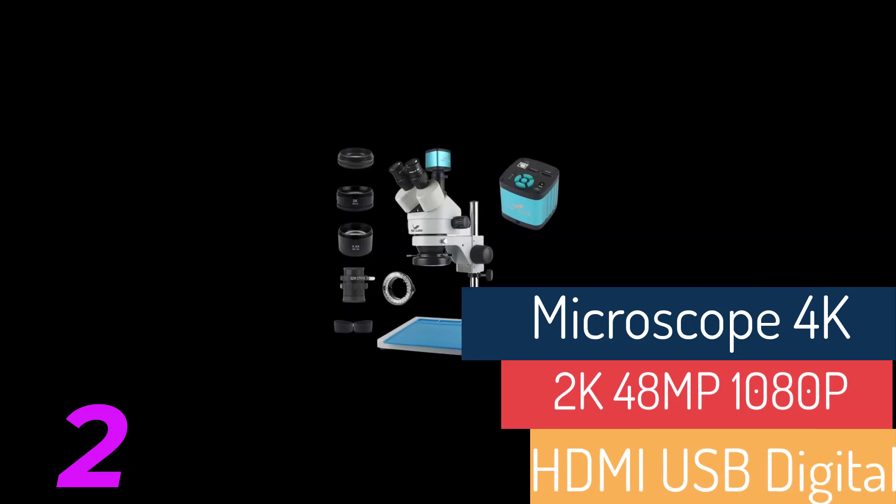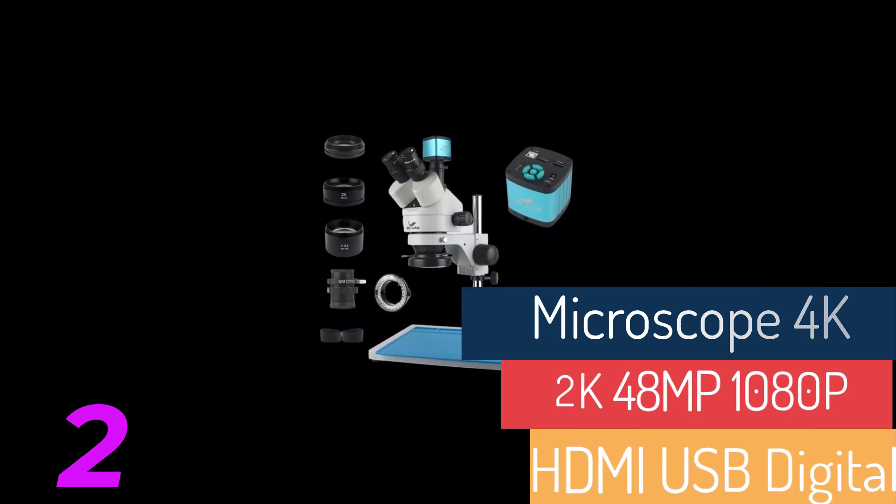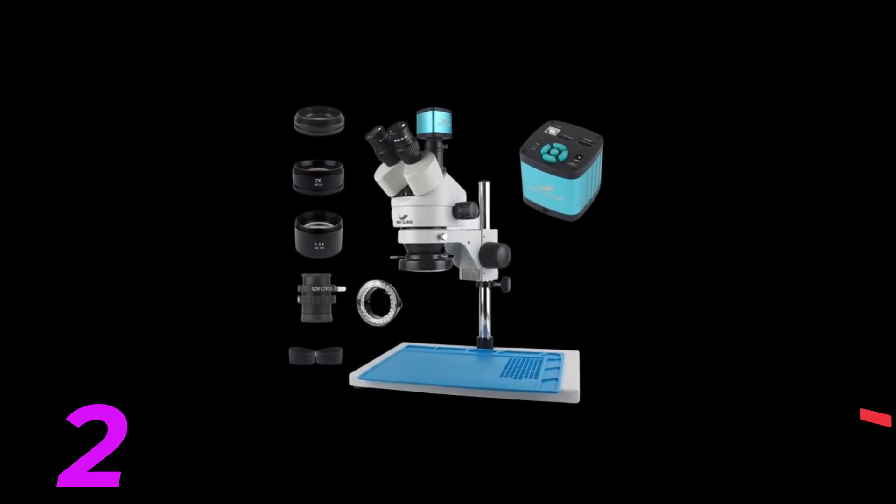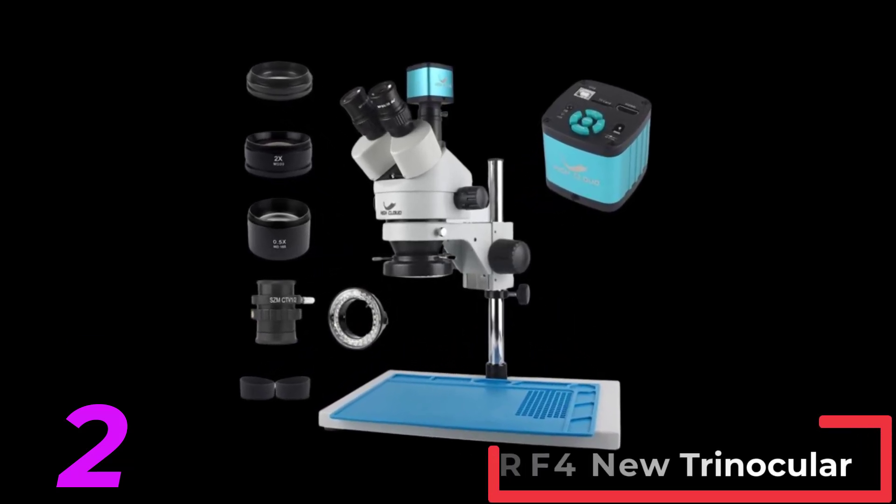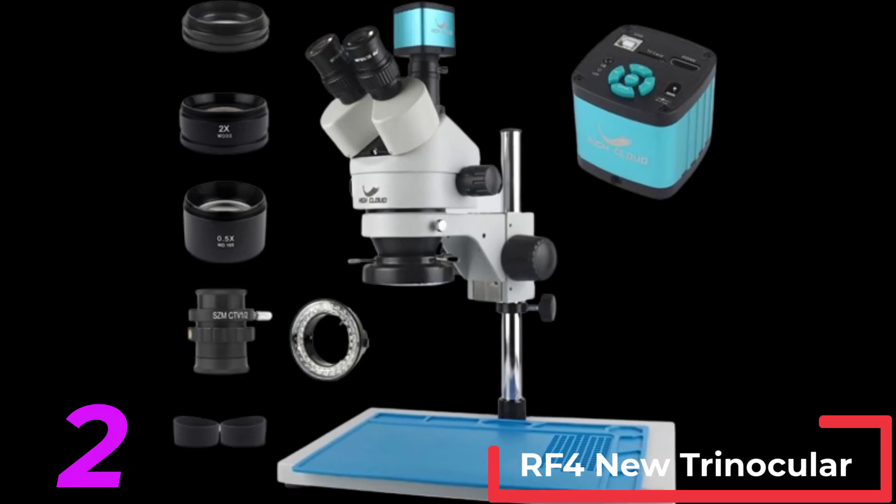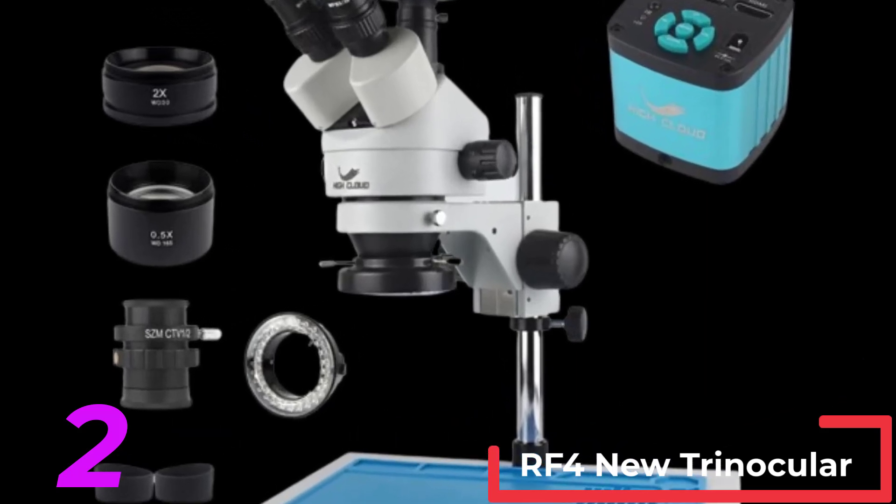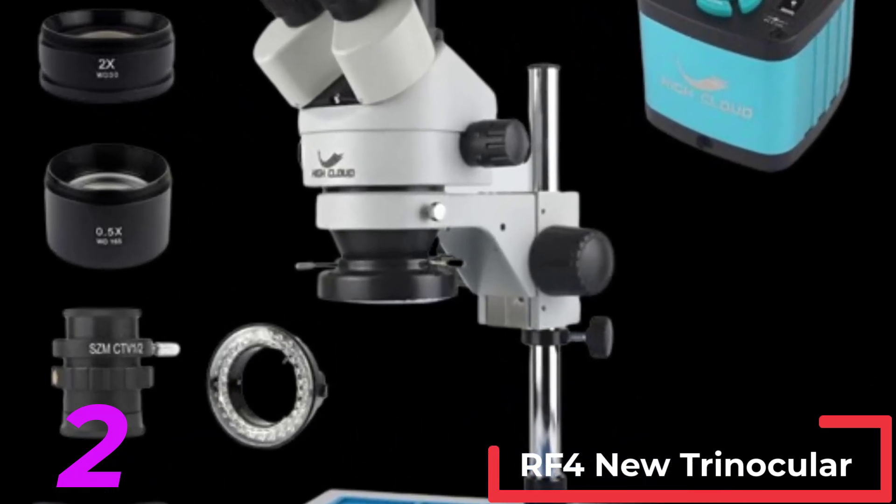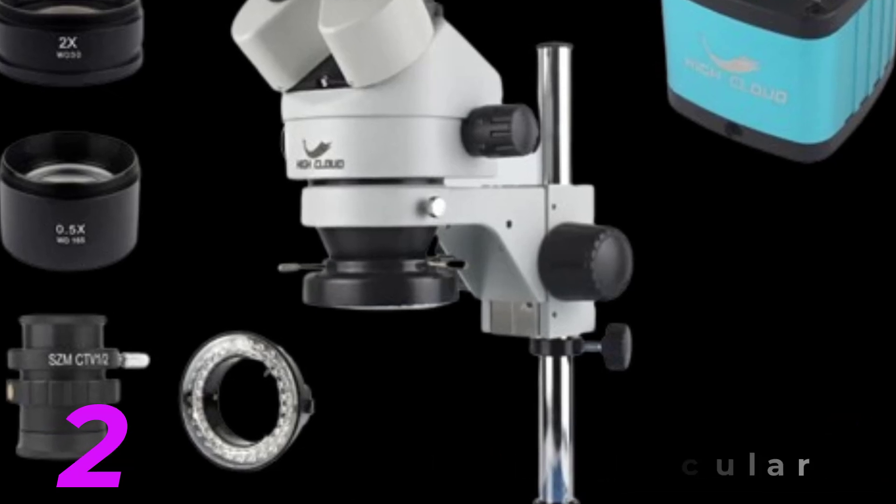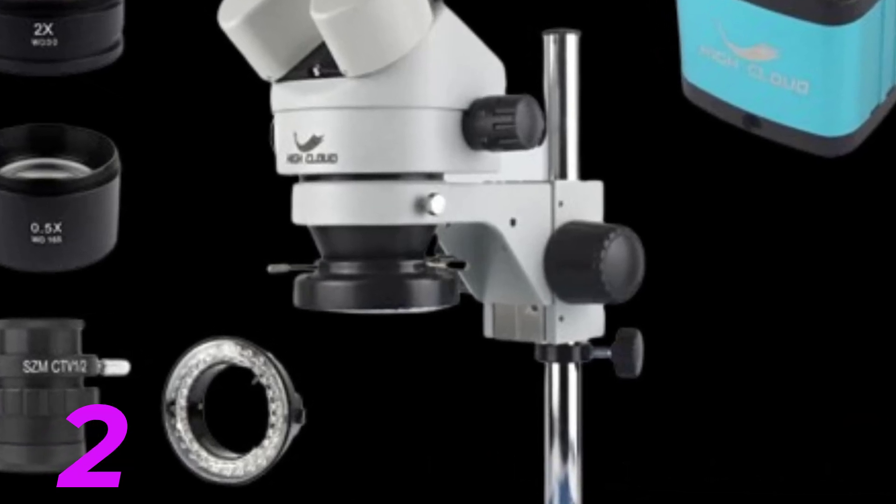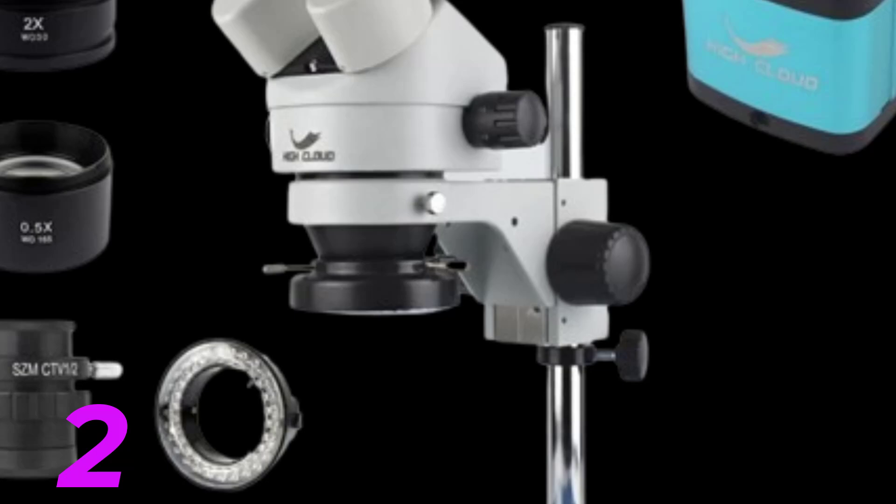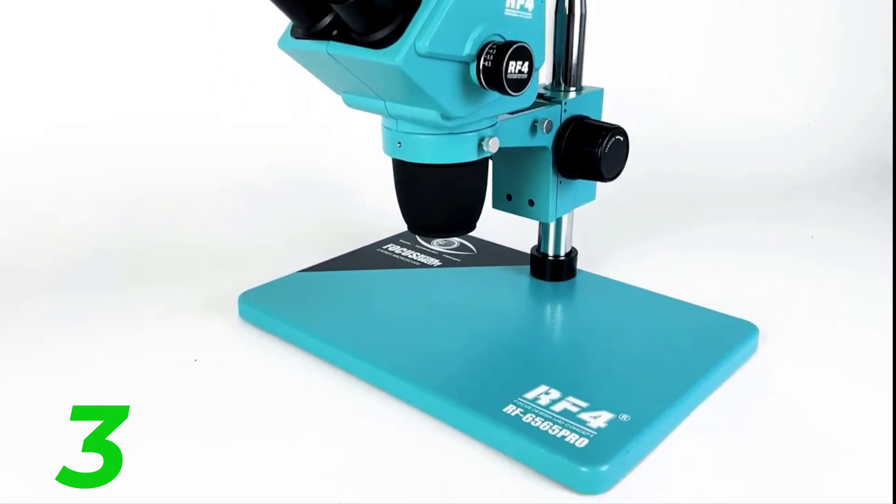The mechanical stage of this microscope features 1.0 mm divisions, allows for precise slide manipulation along the X and Y axis, includes a slide locking mechanism ensuring slides are securely locked in place for accurate observations, and enables coordinate recording so the viewer can return to specific locations on the slide with ease.